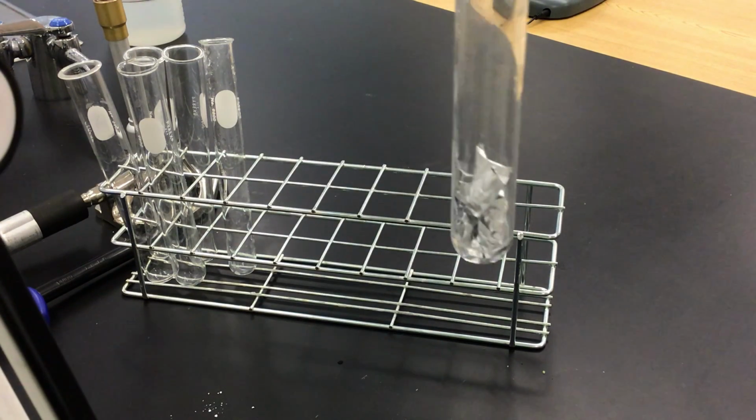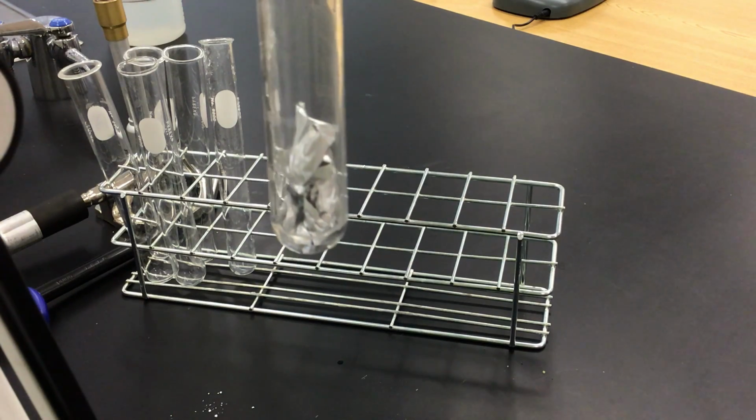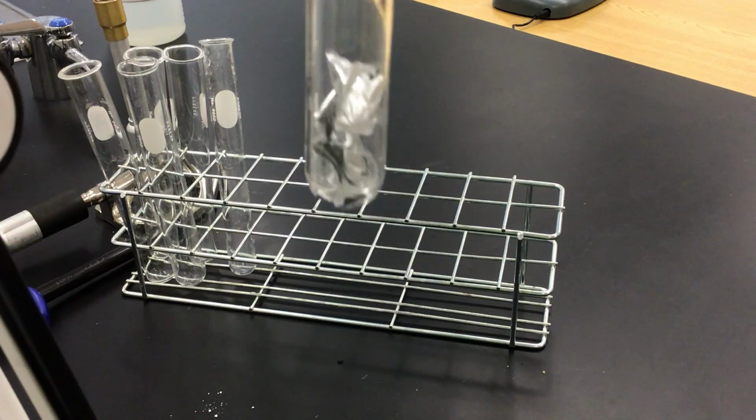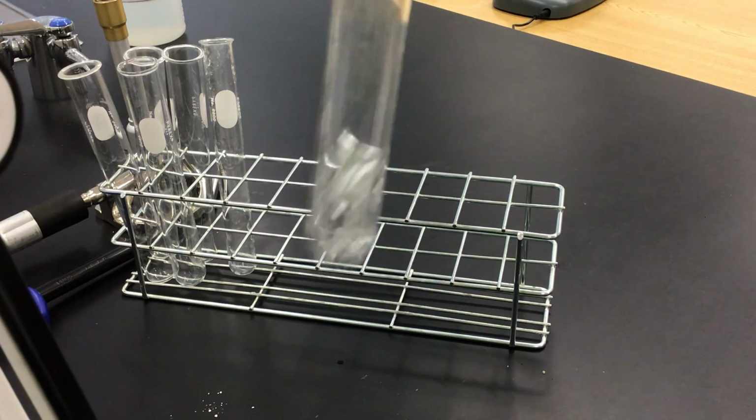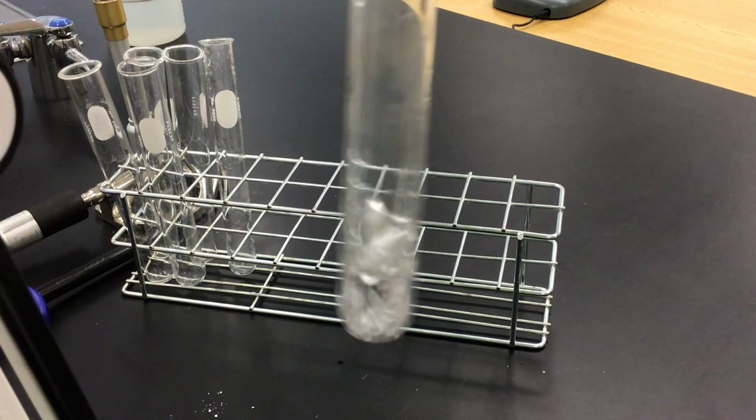So I've got to give it a second. Sometimes reactions take a second to get going. So we've got our aluminum foil in there and our hydrochloric acid, and I'm mixing it a little bit to give it a nudge to get going.